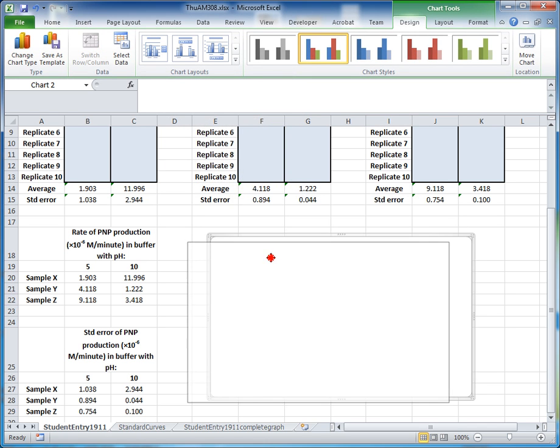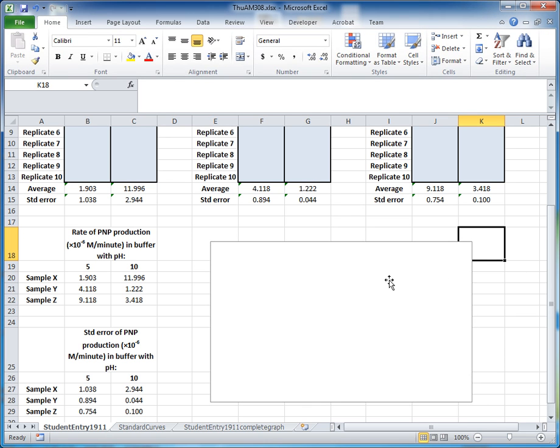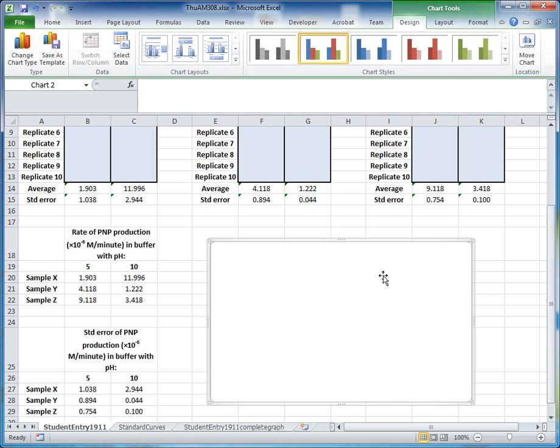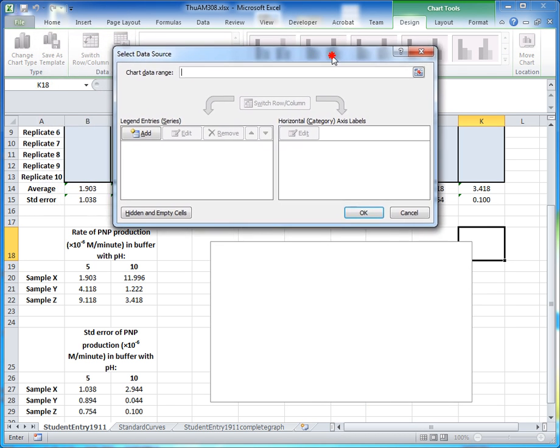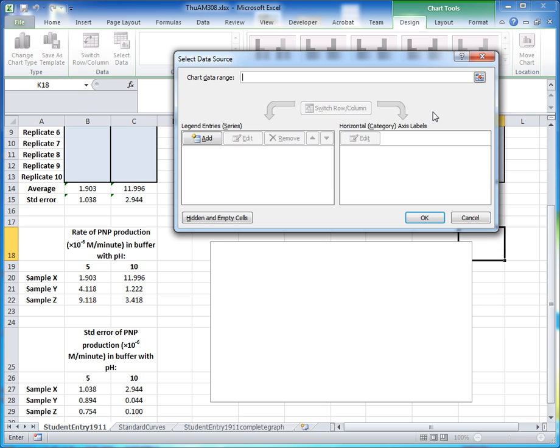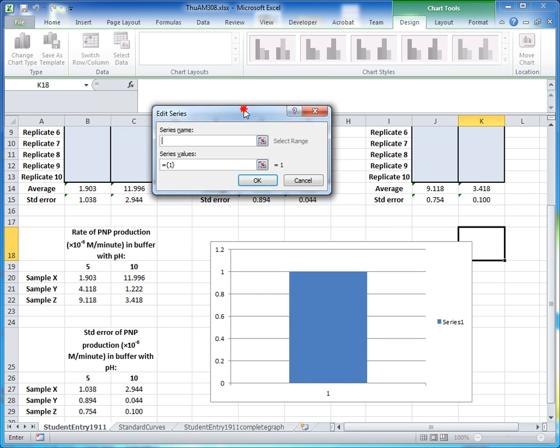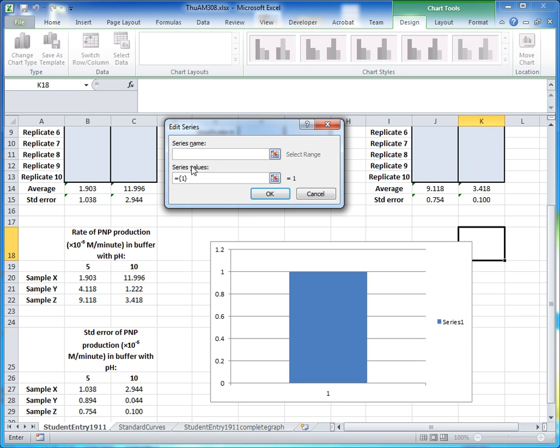Excel gives us a totally blank graph. To specify the data to draw on this graph, right-click the graph and select 'Select Data'. This opens a dialog that allows us to pick the data we want. We want to add two series — one for pH 5 and one for pH 10. To add a series, click the Add button.